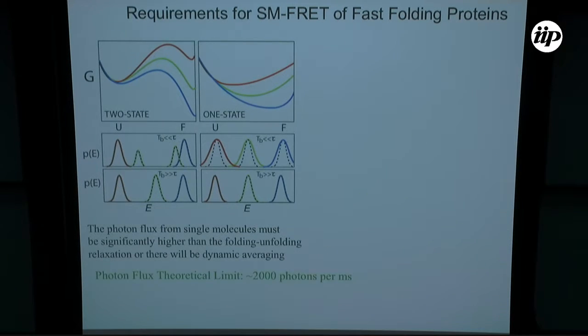So now let me tell you a little bit about why this is problematic for single molecule fluorescence experiments.